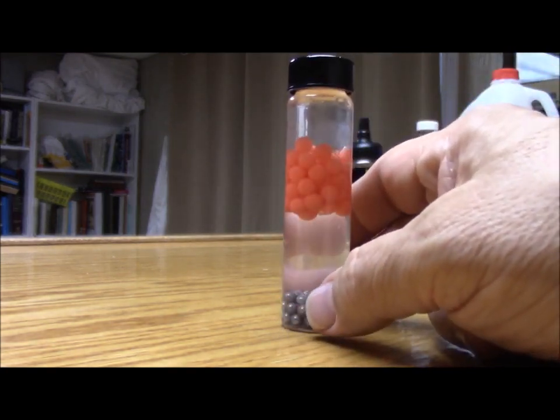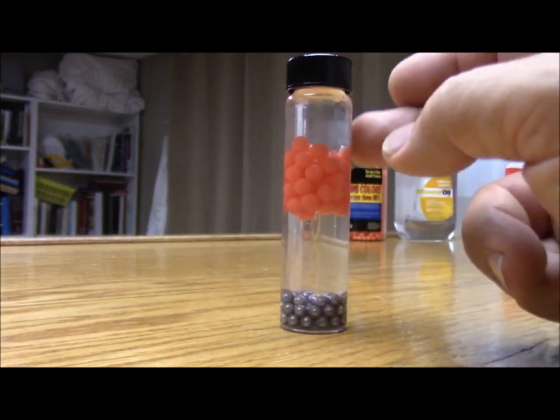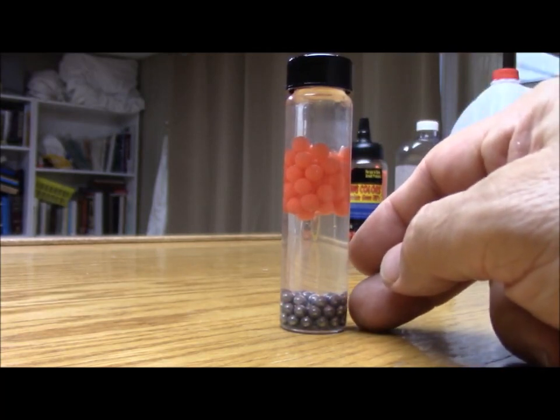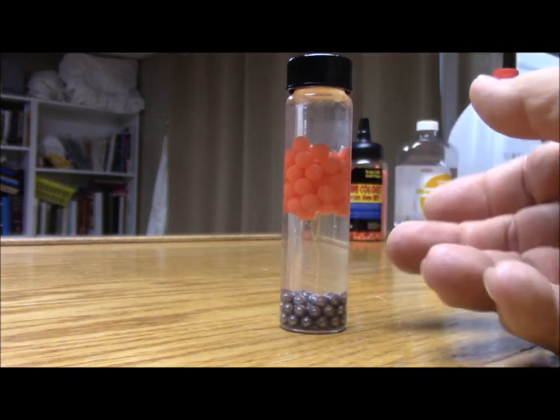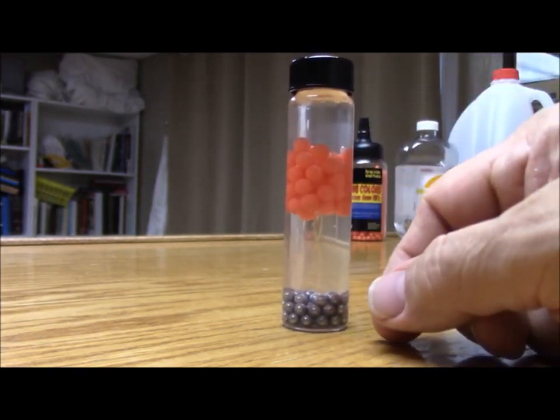Then at the bottom of the first page, how many phases of matter do you see in this vial? And I give you a clue there. For example, in a salad, you might see a tomato phase, a lettuce phase, a cucumber phase, and a carrot phase. So how many phases of matter are you seeing in there?